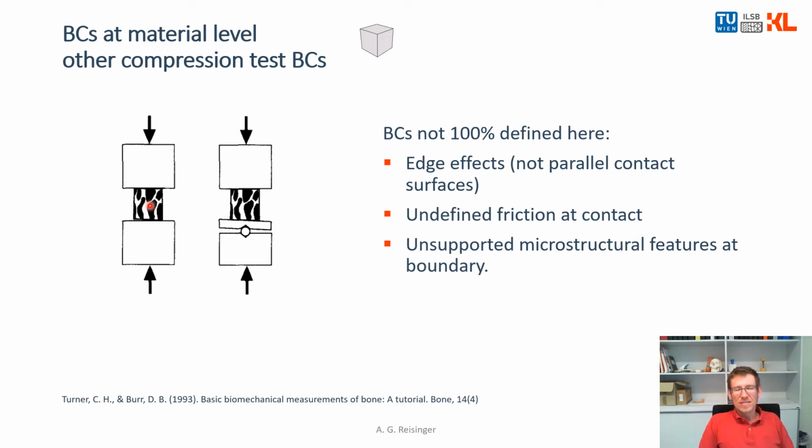Nevertheless, this can be done, doing compression tests like this, because it's easy. I'm doing it currently with the meniscus samples in our lab, because you cannot cut out complicated dog bone samples of some biological materials. That's not possible. So here it's easy, because you only need to cut out cylinders of your sample.